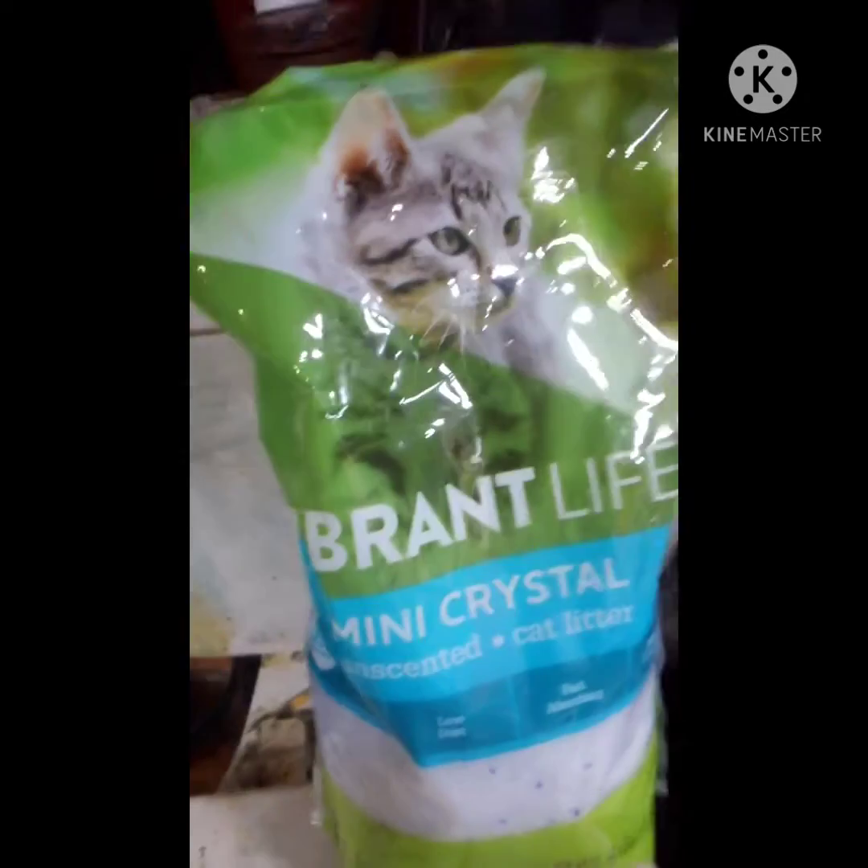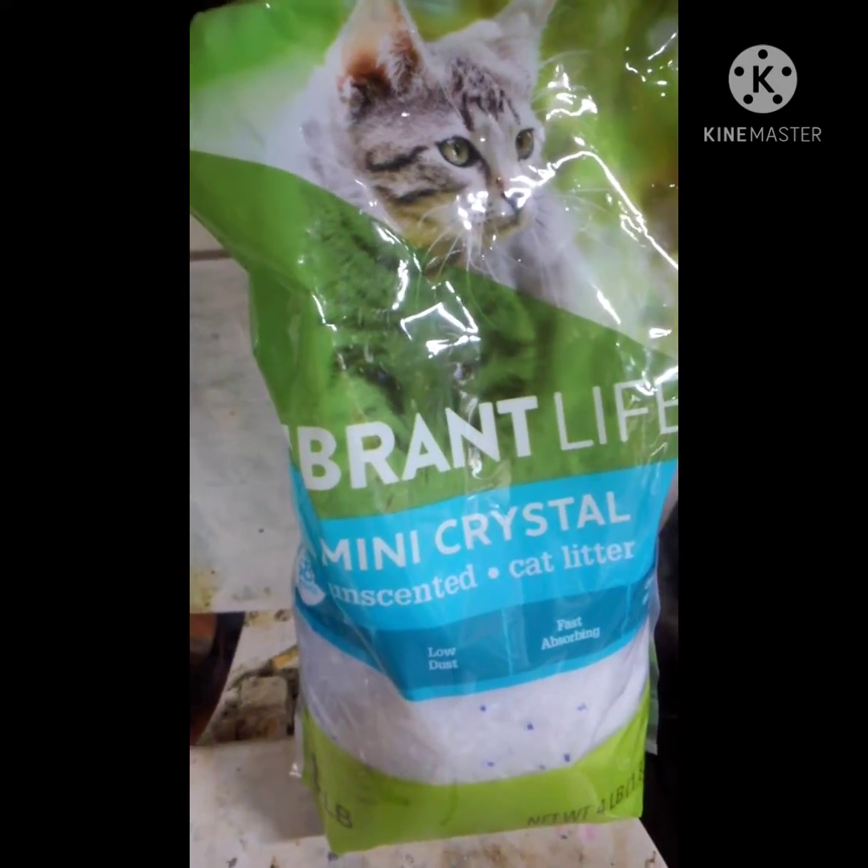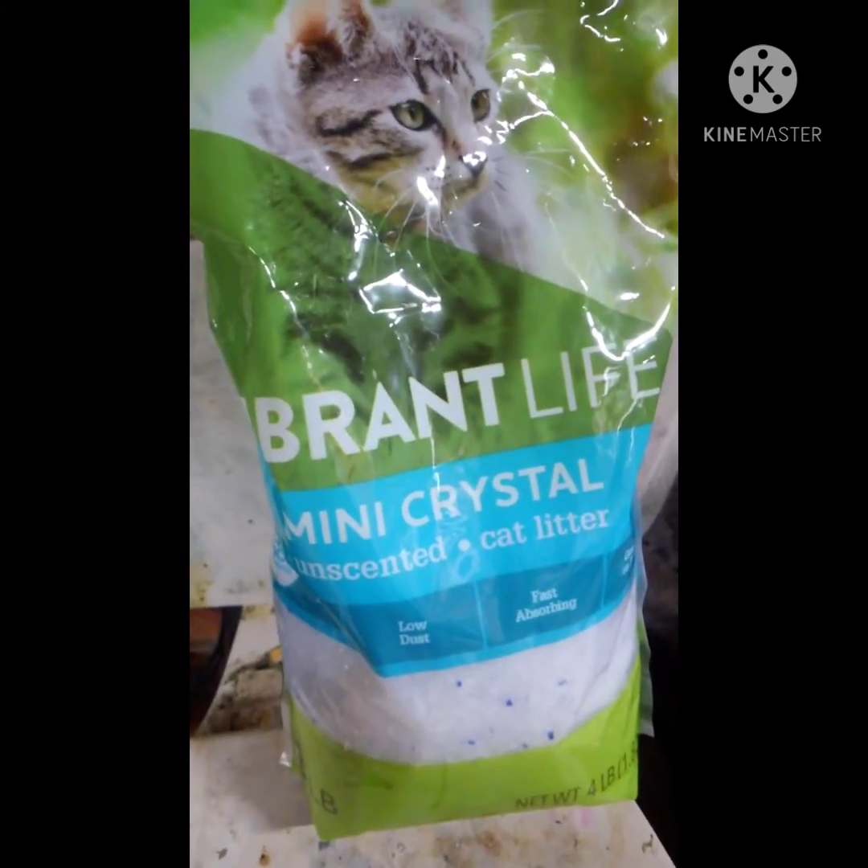The reason I have this cat litter in here is that it's made out of silica gel crystals. You can see there's blue, clear, and white color in there — it's all just different shades of silica gel, even though it is all still just silica gel.